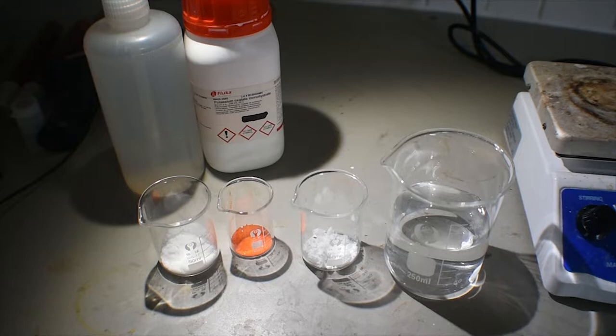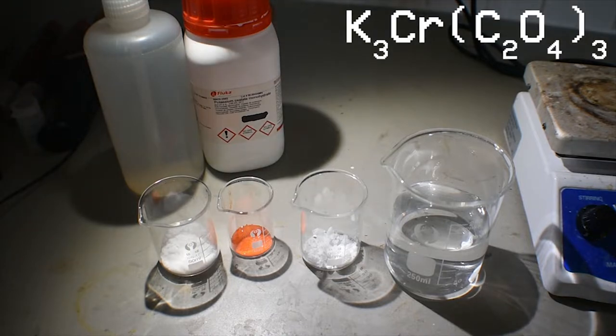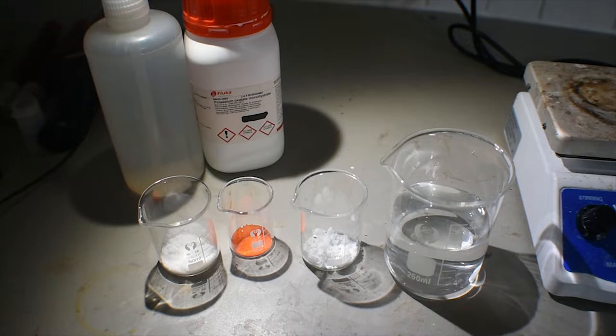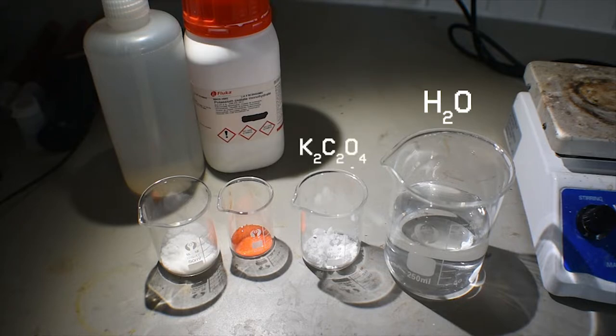These are the reagents we will need to make potassium trisoxalatochromate, a very nicely colored blue complex of chromium-3. We will need 160 milliliters of distilled water, you can see that over on the right, 4.6 grams of potassium oxalate, you can see that in the beaker, second from the right.